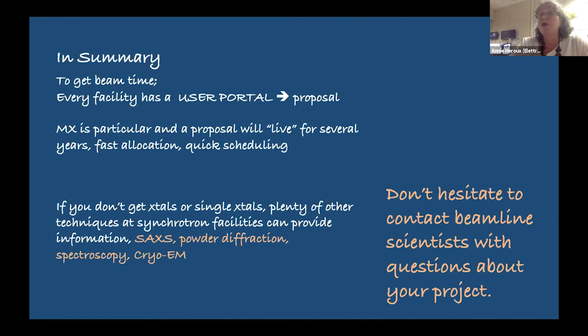If your samples aggregate, if your samples make tiny crystals and you have powder instead, if you need to do some spectroscopy, you need to modify the starting point. But all of these techniques don't exclude the other one. At one point, you can get all the information you need from all different fields and beamlines that you use at the synchrotron.